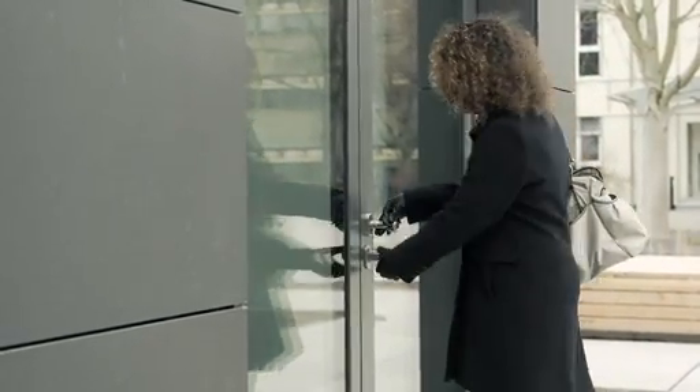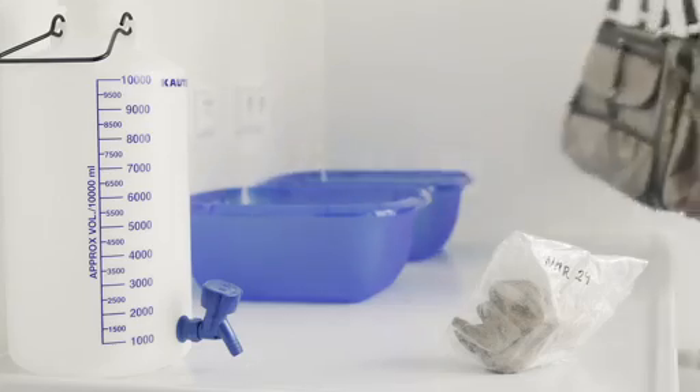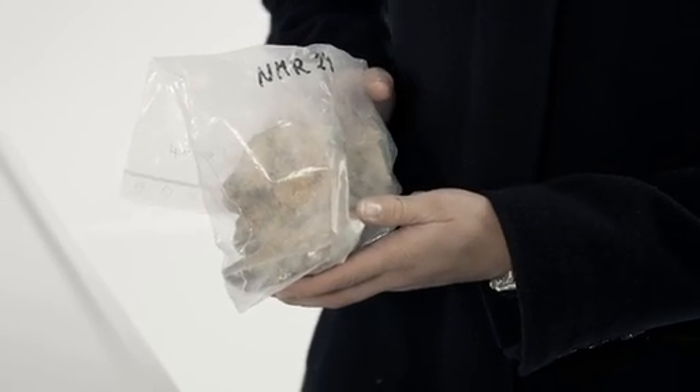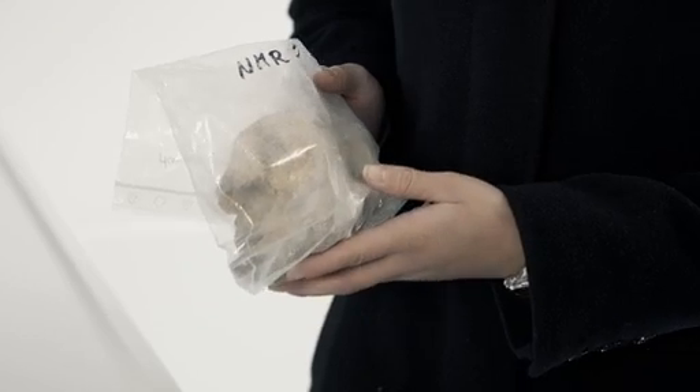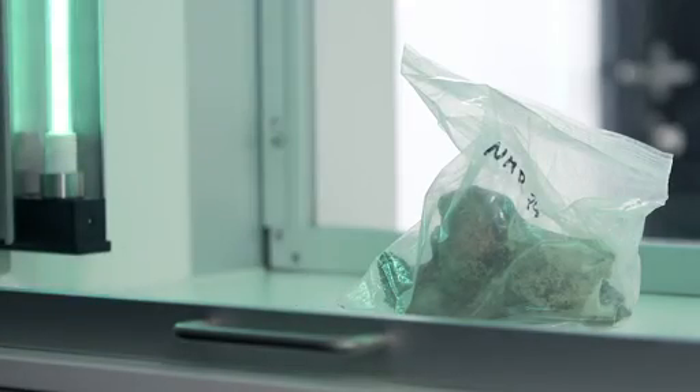Let me guide you through it. I have some very old bones here that we plan to analyze. The problem with old bones is that they contain very few ancient DNA molecules and they can become easily overwhelmed by modern DNA contaminants from the environment. We follow a very particular procedure to make sure that the samples, the rooms, and the people get cleaner with every step.